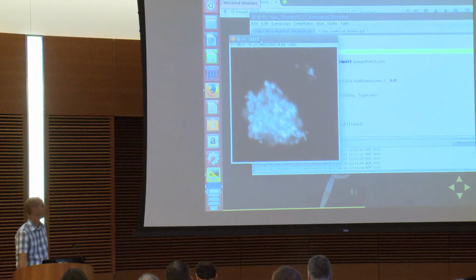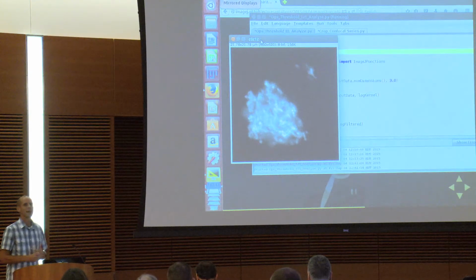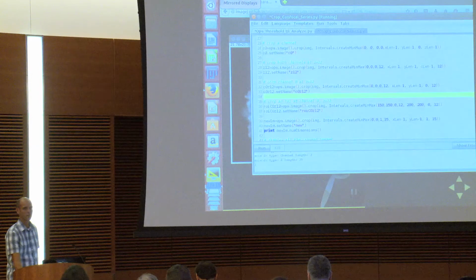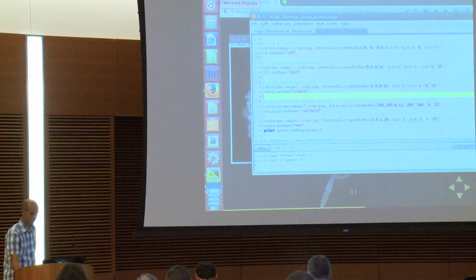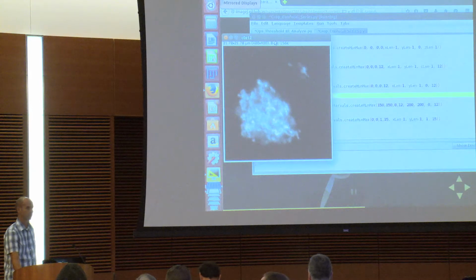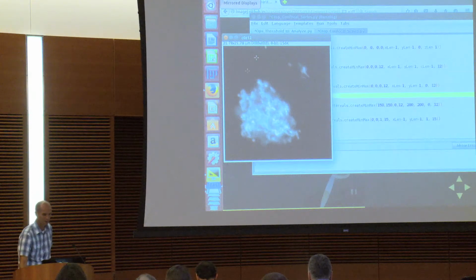And maybe save it if you don't want to regenerate it again. If you're going through these tutorials and just getting an explosion of images, close everything, open up the confocal series sample image, and run the crop confocal again, and you'll get the cropped images that we need for the next step. Does anybody want more time to quickly do that?